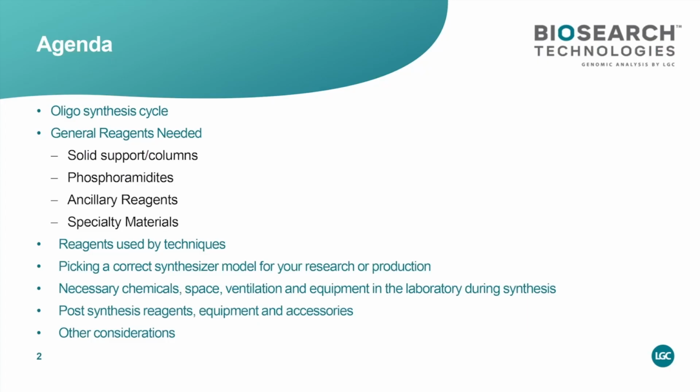So, the agenda for today would be the oligosynthesis cycle, general reagent needs, which include solid support columns, phosphoramidites, ancillary reagents, specialty materials. Then some of the reagents used by techniques, I will pick a couple.